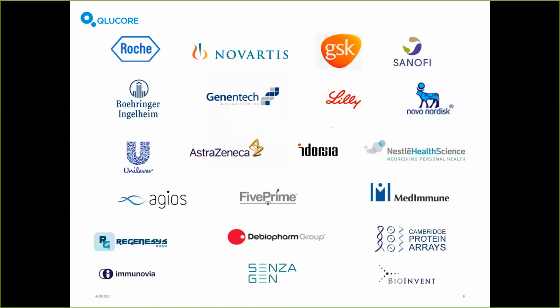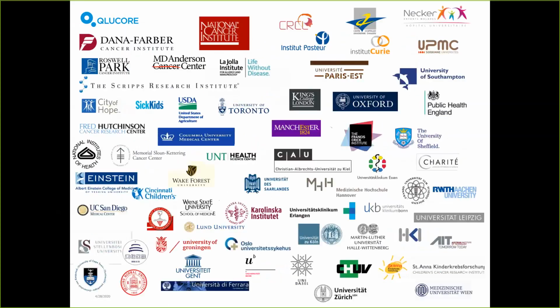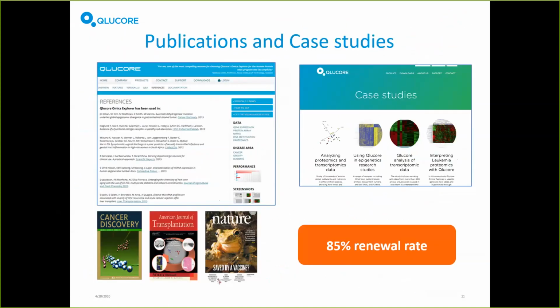Here's a few examples of customers of ours. But that's not the whole point here today. The whole point here today is to show you the software. I just want to mention also that we on our homepage have publications and case studies if you want to have references to research being done with our software previously.